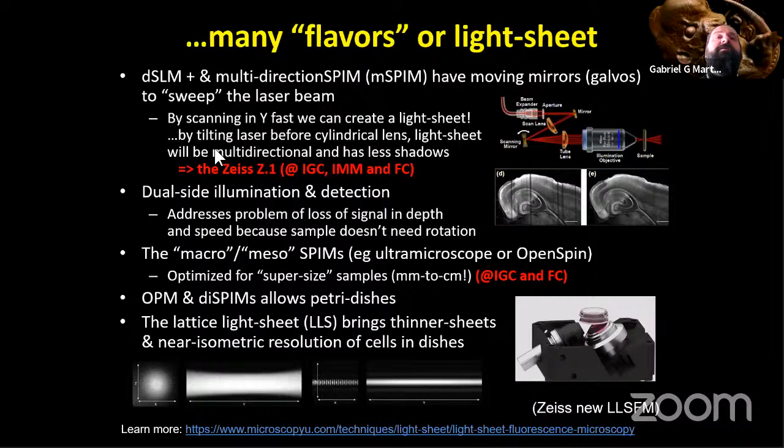And that's basically how the Zeiss Z1 light sheet operates to eliminate the shadows, in what they call the pivot mode. Another interesting development is the use of 2 lasers, dual side illumination. And as you may have guessed, we're typically looking at very large things. So there's still this frustration that as you move farther away, the portion of the tissue that's far away from the objective will be difficult to distinguish because there's still scattering of light. It's going to be very, very difficult to image through all of the tissue with the same quality.